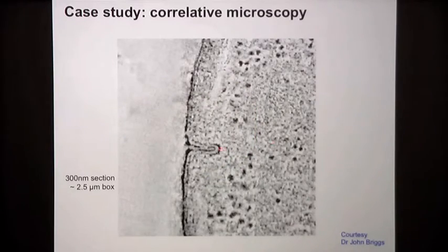I should mention that this is not possible without tomography. If you took single images, you would not see that. You would have to take a tomogram to see the entire density. So I think that's one exciting application of tomography, which could become very important in the future.